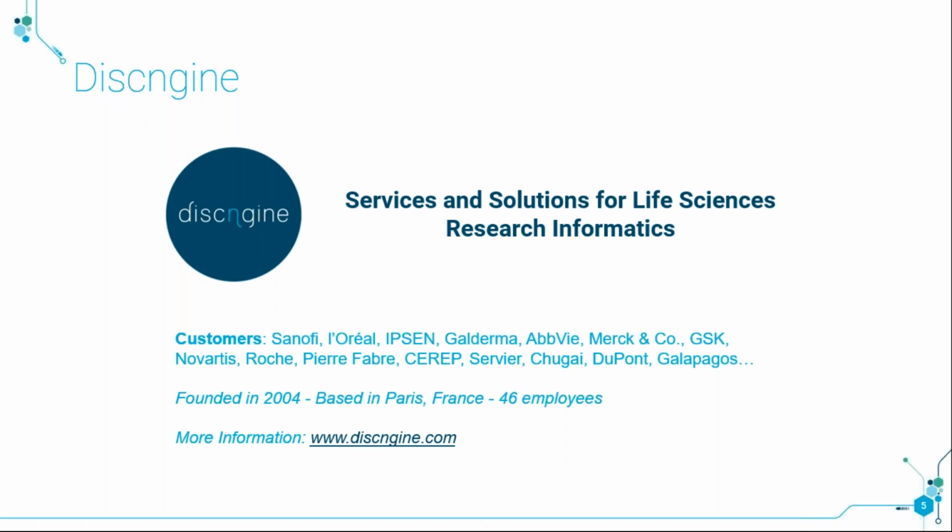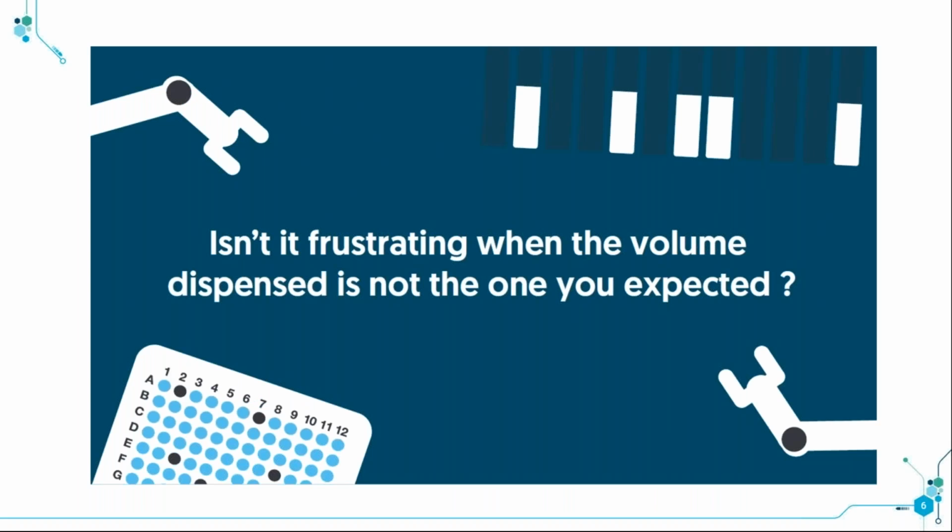Today we are here to talk about Discngine Qualification. The specific question that we would like to address with this application is: isn't it frustrating when the volume dispensed is not the one you expected?